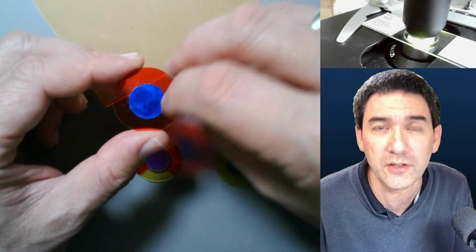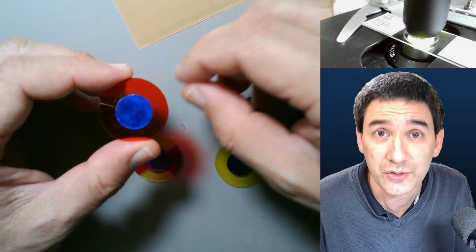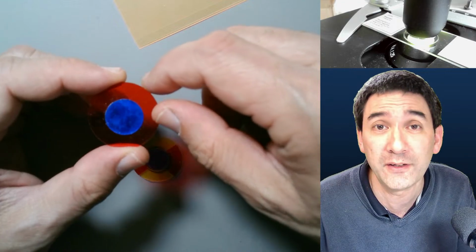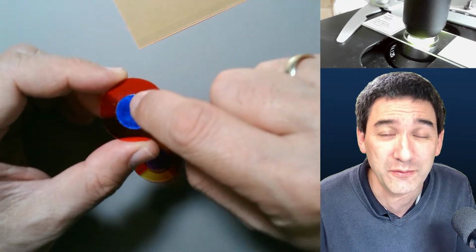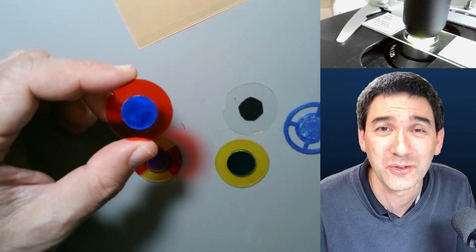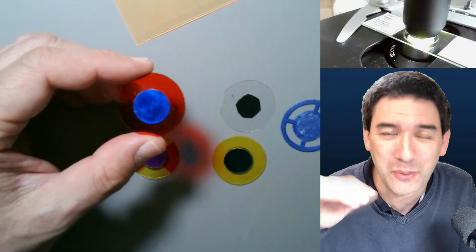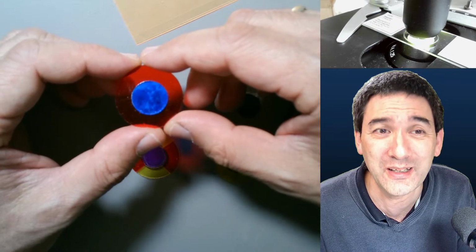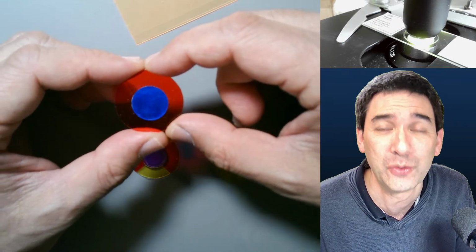Otherwise, you can try to use markers and draw those things on an overhead foil. However, I found out that with markers there are two disadvantages. First of all, you never get such a smooth, consistent color, so when you put it under the microscope, you see that some parts are not evenly colored. And the second disadvantage is that with markers you do not get quite such a strong color, so you would have to stack several of those on top of each other.